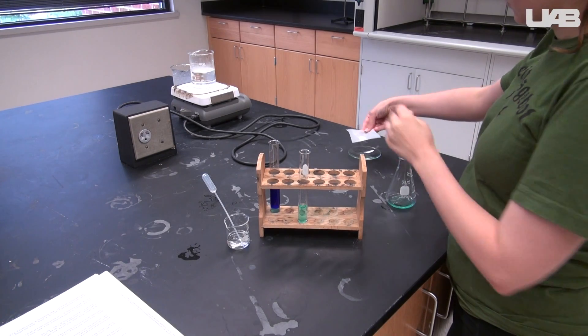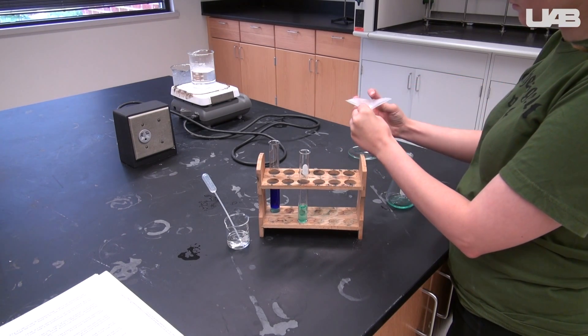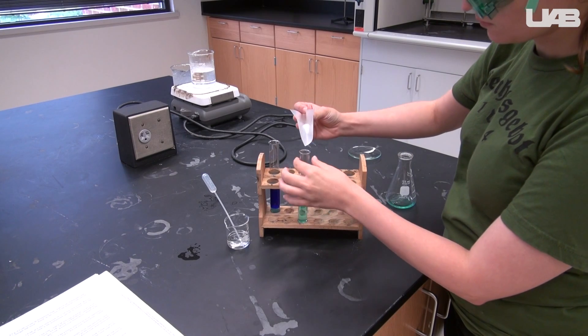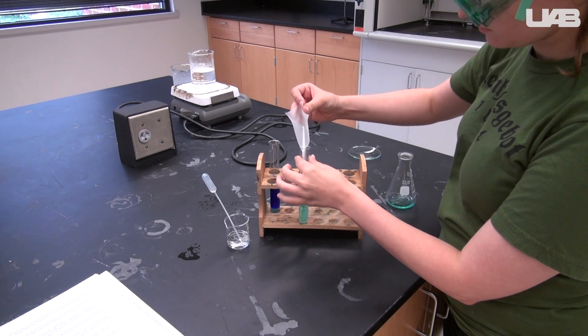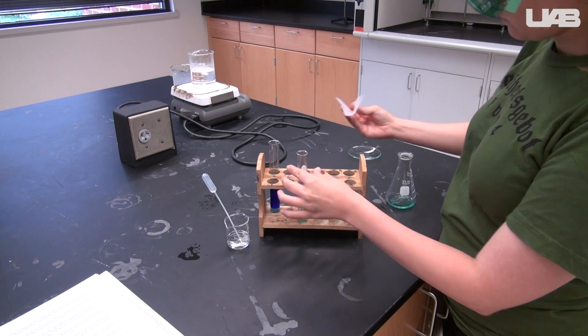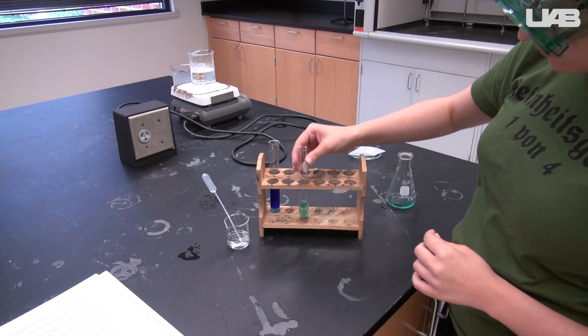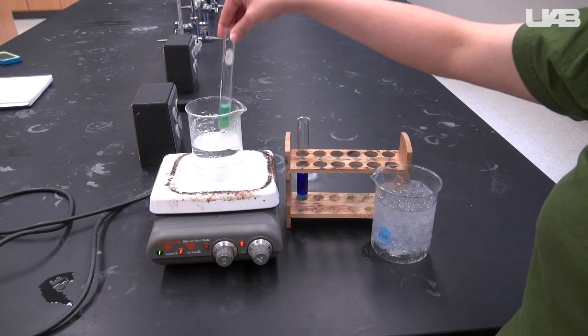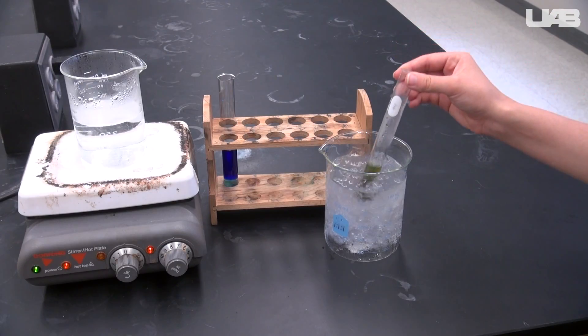Get another test tube and pour 5 milliliters of your copper bromide solution into it. Add 1 gram of potassium bromide to the solution. Record your observations and decide what the dominant species is. You will place this test tube in a hot water bath and then in an ice water bath.